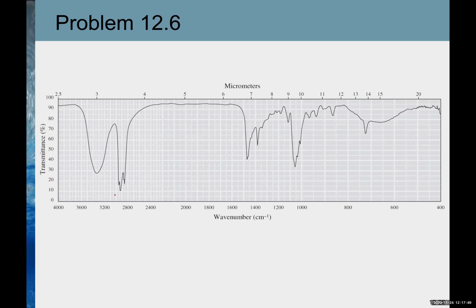What do you think? Is it hexanol? Everyone sure about that? How do you know that this is hexanol? What made you say that it's hexanol? It has the OH peak at like 3300 or something, 3 to 400. Yep, that is the OH stretching.